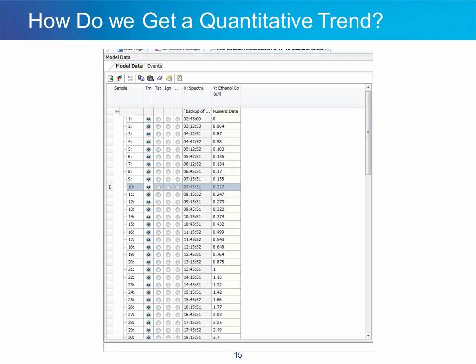In an actual implementation, the calibration would be tested on subsequent runs to ensure the calibration standards are representative. If the model worked for the tests, it could be put into service and used for as long as possible. Usually a calibration is used for months or in some cases years. During this time it is periodically tested to see if maintenance is needed. Maintenance usually requires adding or substituting new calibration standards or correction factors to keep the model working properly.